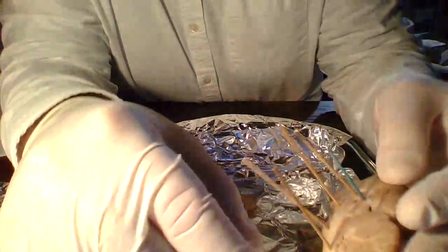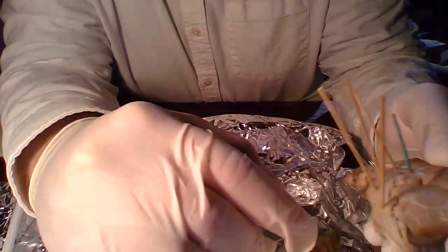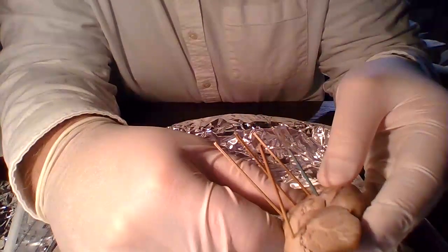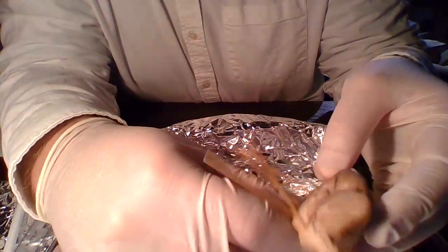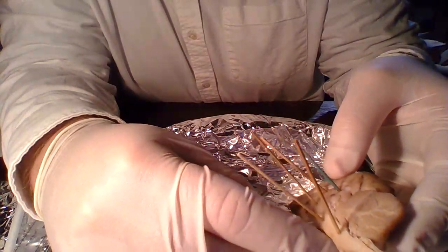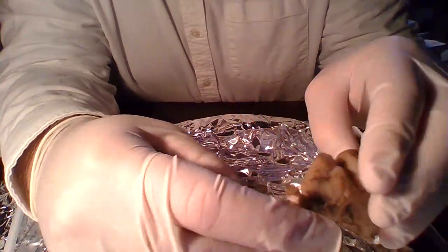So that's that thing done. Let's see if there's any other observations I can make. Not really. I was looking to extract a hippocampus from here, but I doubt I can get that. I could try to follow the fornix, but I'd rather keep this bit intact, and I already have my coronal slides ready. I think this is ready for a jar.